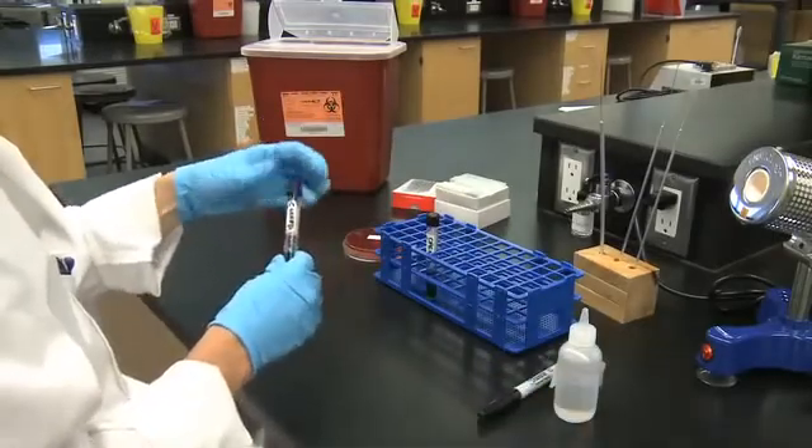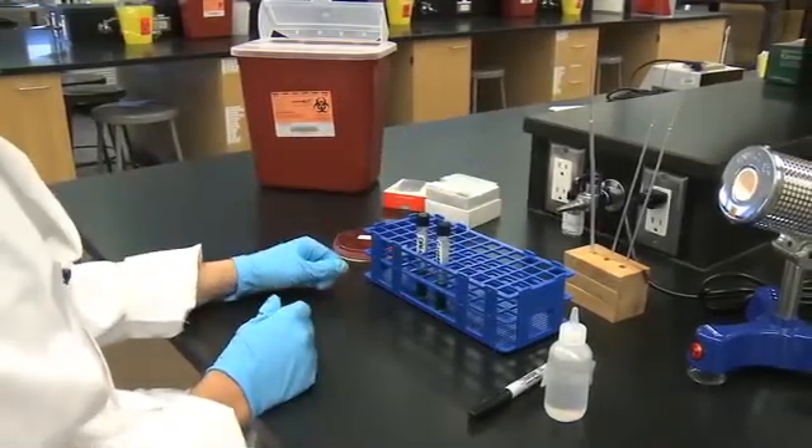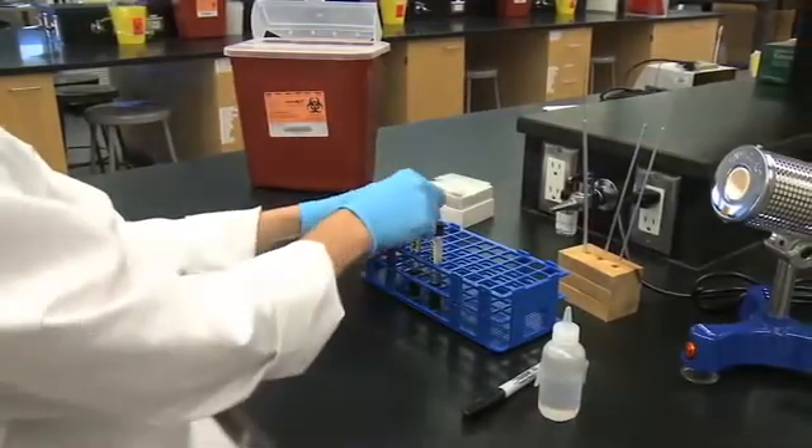Incubate the tubes for 18 hours at 35 degrees Celsius aerobically. Ensure that the caps are loose.